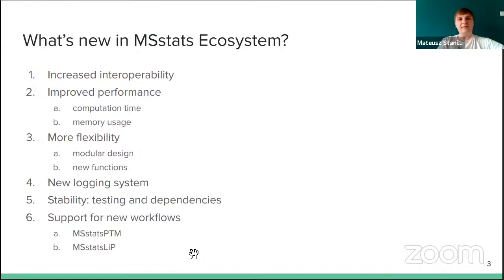We wanted to give MSstats more flexibility, so more control to the user, more possibilities of doing the computations. So I'll talk about it in a moment. Also, a new logging system, which might be useful. We also had in mind stability of the software.